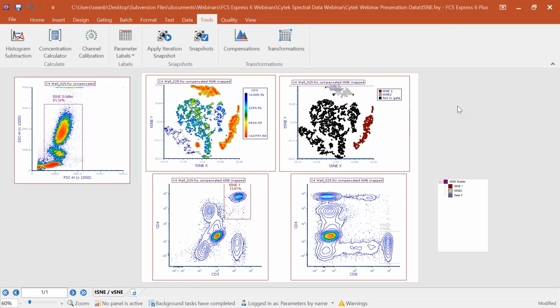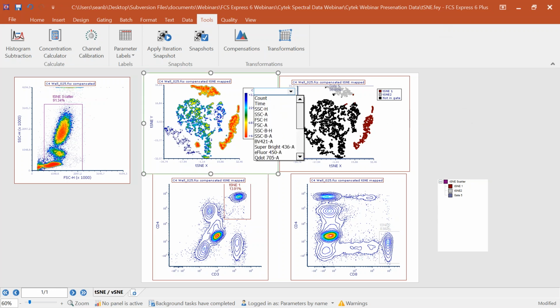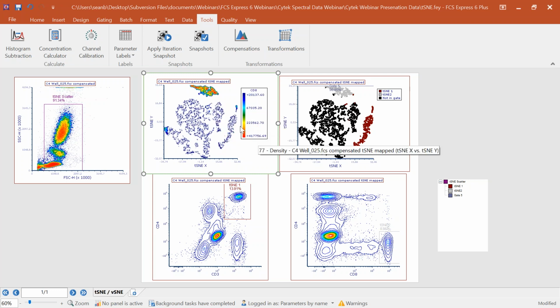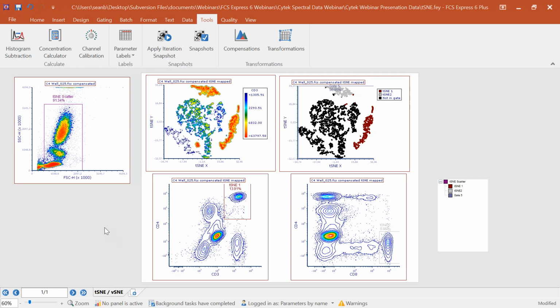I can get this out of the way, and we can start analyzing or exploring this data with some of these tools. So if we wanted to come in and say, all right, let's look at the heat of CD4 on our t-SNE charts, or let's look at the heat of something like our CD8 here, we can start using these t-SNE visualizations to drill down into these clusters and these continents and help figure out what's going on. And again, this is all linked to the raw FCS files and the spectral data.